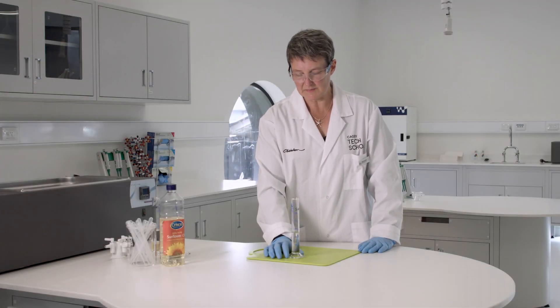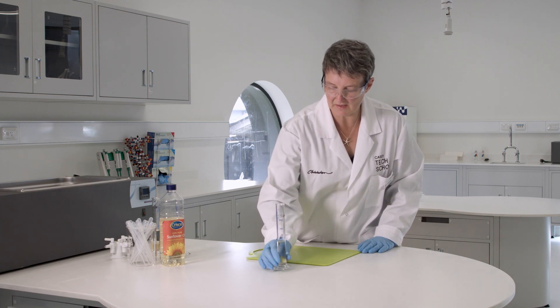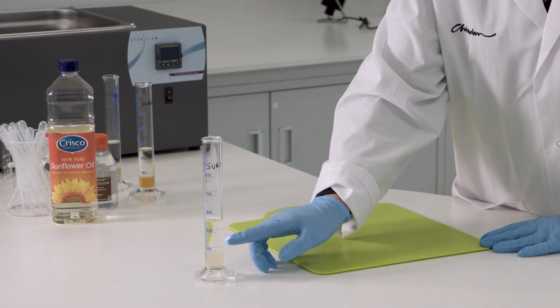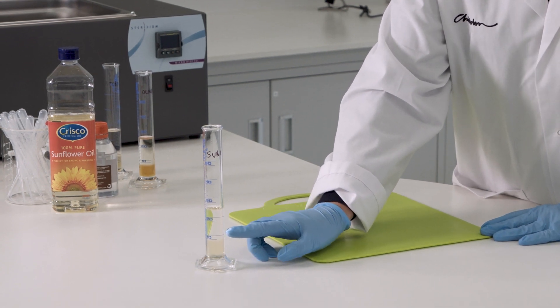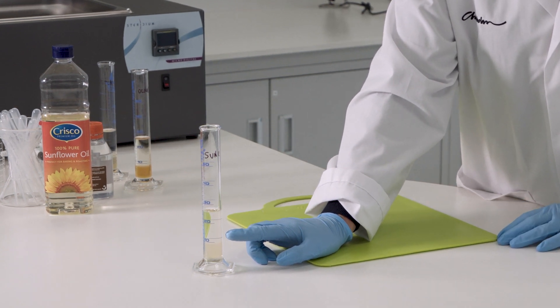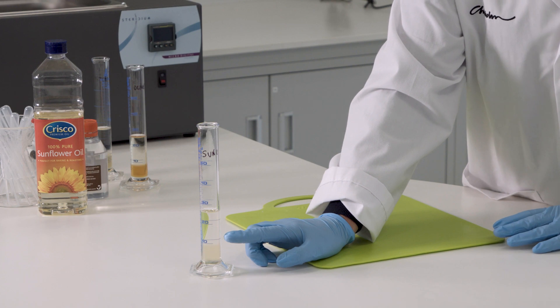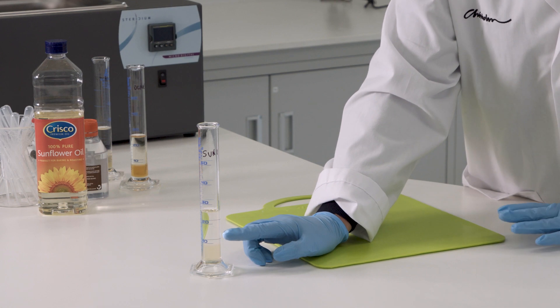Our biodiesel has been sitting for about 10 minutes and it has started settling. If I move it out onto the white background you can see we've actually got two different layers. We've got our biodiesel in the top layer and in the bottom layer we've got our glycerol mixture. Of course no reaction goes to full completion, so we'll have some unreacted lipids in there too, and depending on how many fatty acid chains are left, that determines which layer they may be in. You'll be able to read off the volume of the biodiesel in the top layer.